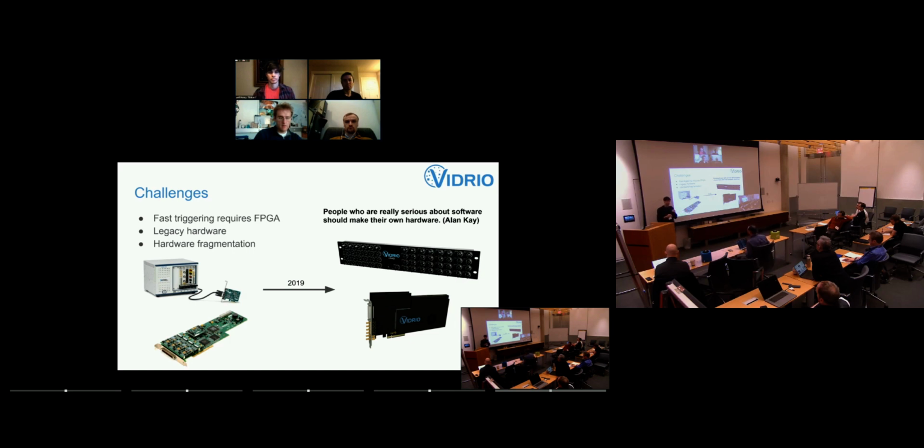We run it on a piece of hardware called an FPGA. You can think of an FPGA as an empty chip that has certain resources like logic gates and lookup tables, and you can wire these resources together, and that gives you a very deterministic real-time system with nanosecond latencies. So that's what we use to generate all our triggers, generate all our sample clocks, and so on.